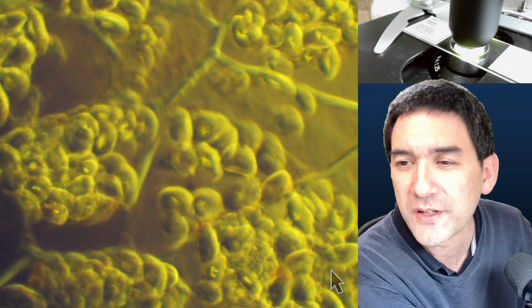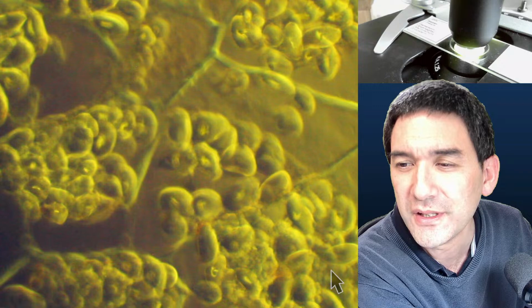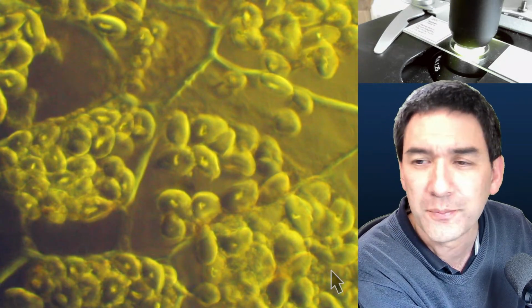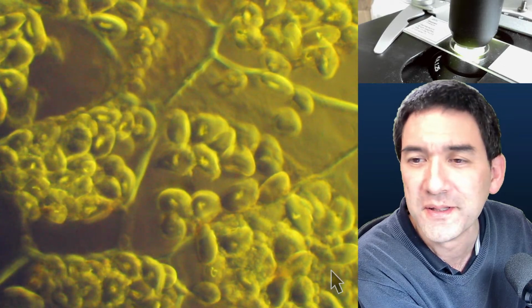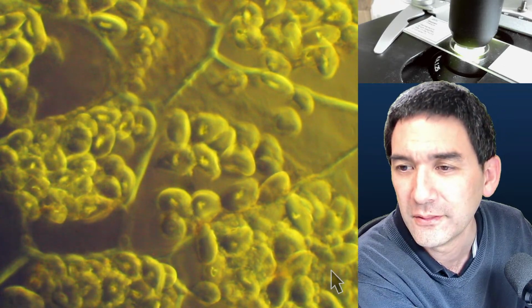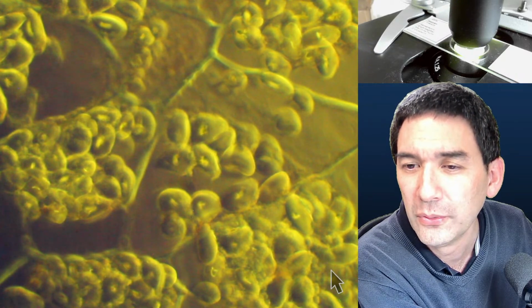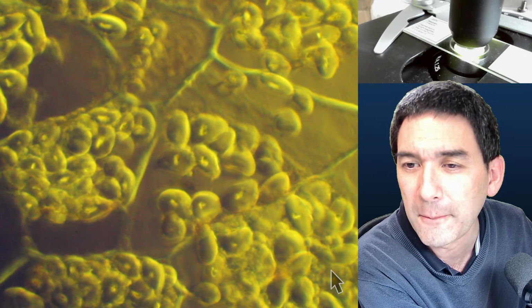When I use polarized filters, are the rainbow colors minerals? I see some microbes have rainbows inside and some don't. It could be that those microbes maybe swallowed some substances that were optically active. Will a black ring in between the central blue disc and the red outer ring maybe increase the contrast?